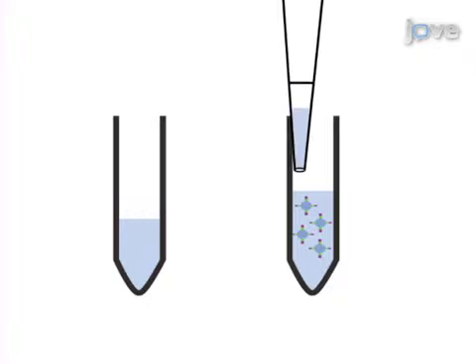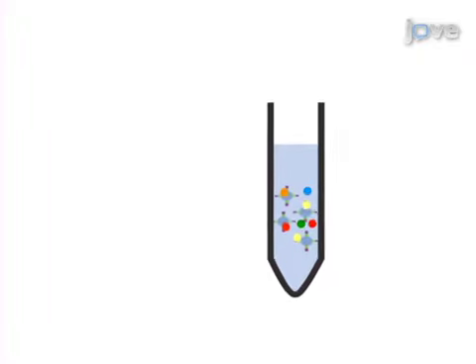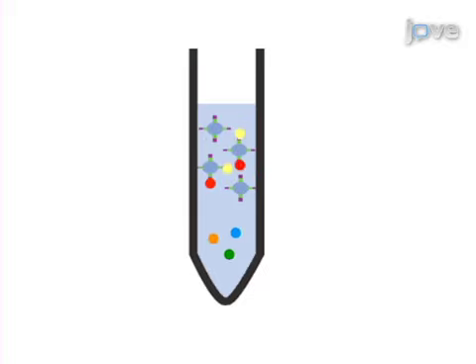To identify cellular factors that interact with the secretion modification region, or SMR, of Nef, co-immunoprecipitations are performed using SMR wild-type Nef as bait.